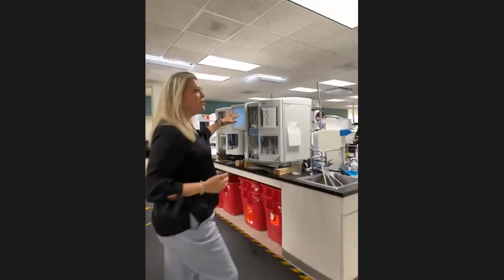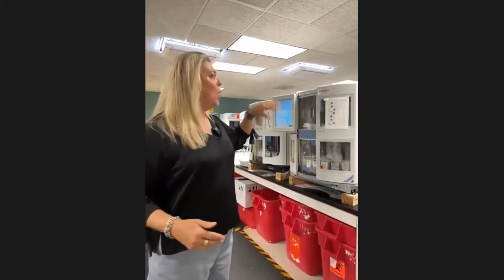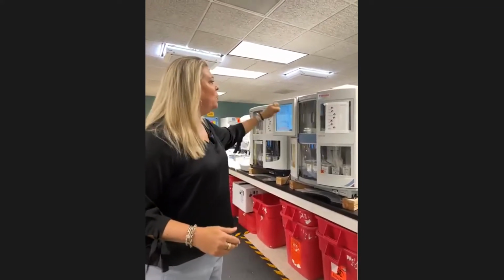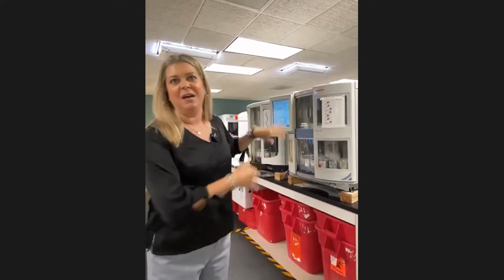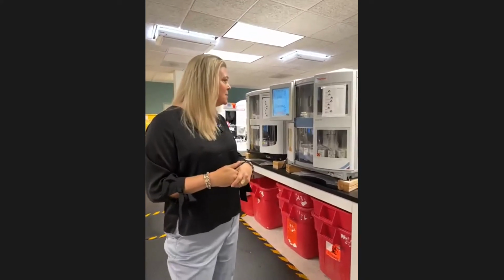So there are computers built into these machines, and a program of what chemical they're going to go in, what solution they're going to go in, and it just goes in and out of different things and gets stain put on it. And then it comes out with all kinds of pretty colors on it, and it highlights different areas of the tissue so that the pathologists can see certain things better than another. So yeah, that's pretty much it for light microscopy.